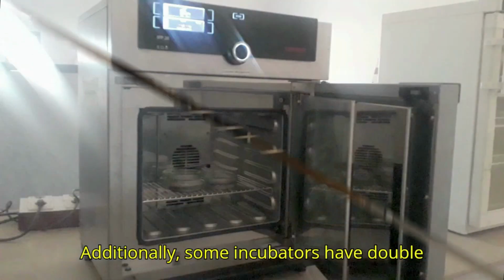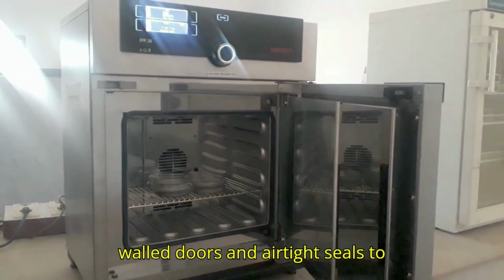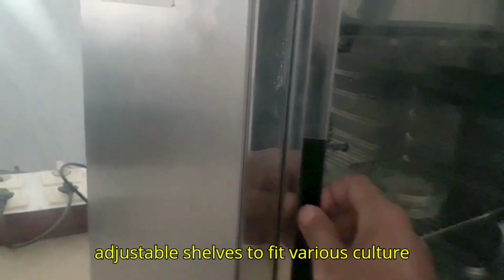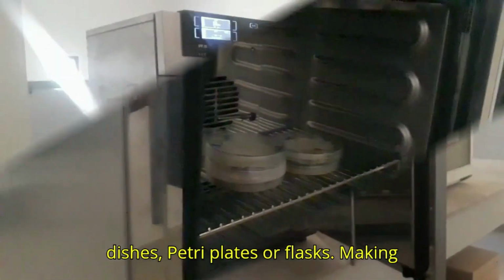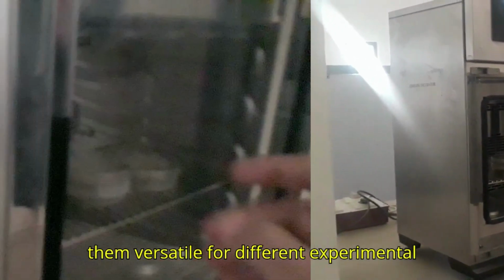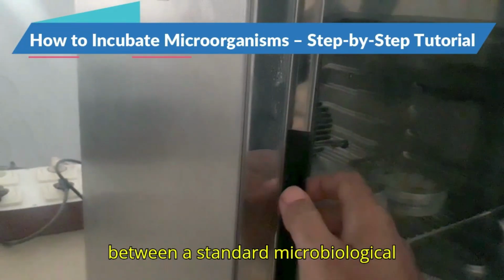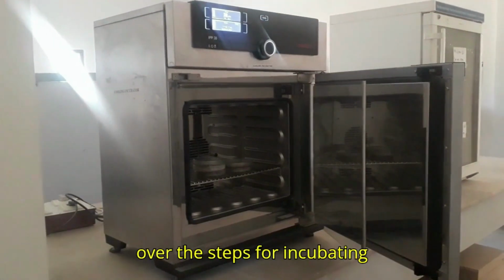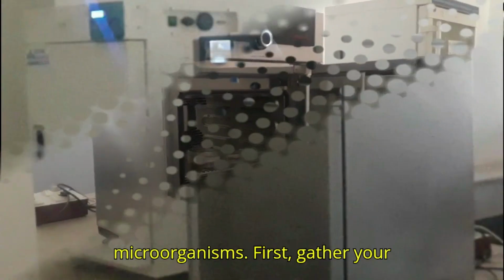Additionally, some incubators have double-walled doors and airtight seals to maintain a stable internal environment. For added flexibility, incubators have adjustable shelves to fit various culture dishes, petri plates, or flasks, making them versatile for different experimental setups. Now that we know the difference between a standard microbiological incubator and a BOD incubator, let's go over the steps for incubating microorganisms.